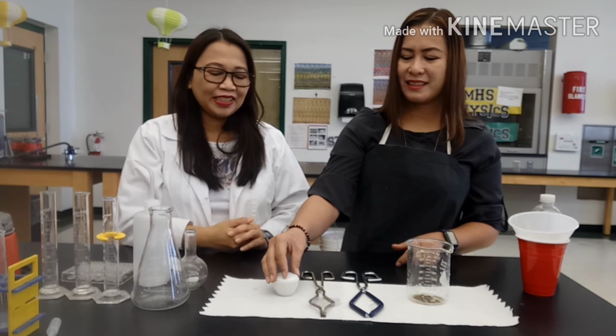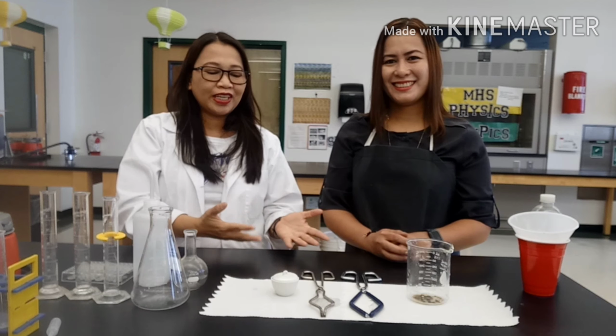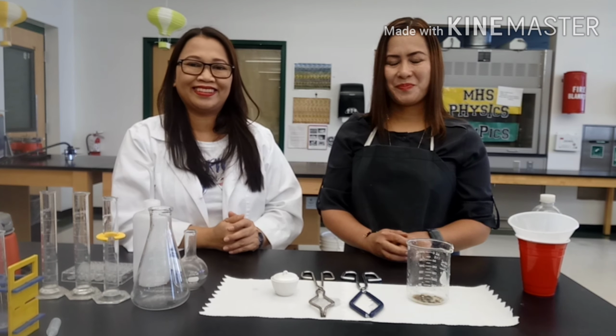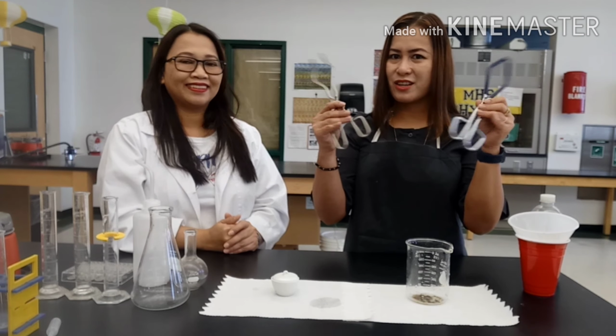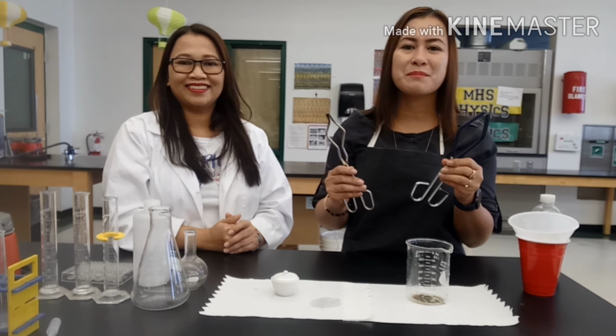All right, so this time we're going to have the crucible tongs and the beaker tongs. So which one is the crucible tong and which one is the beaker tong? Any idea? Well, this time Miss G and I will present to you the difference between the crucible tong and the beaker tong. Let's start. In the lab, we use different tongs, but for now, we will be introducing to you two different tongs over here. Now, which one is your crucible tongs and which one is your beaker tongs?